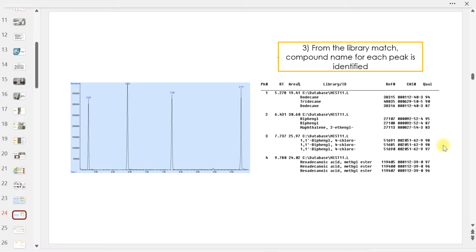Dia tak masuk dalam detect tapi dia punya kualitatif tu less than 80. Ini contohlah 3 sajalah. Mungkin banyak lagi. Lagi kuranglah match. So bila not matching to the library itself, so possibility mungkin new compound. Cuma kita tak tahu what is the compound because there is no library yang match lah. Ataupun library tu yang tak update.